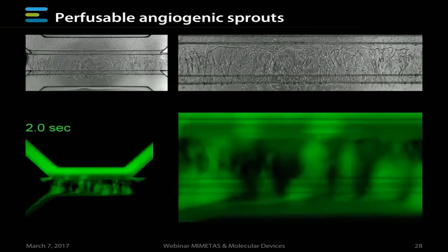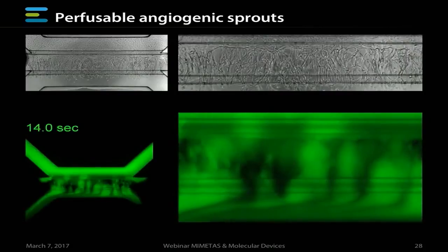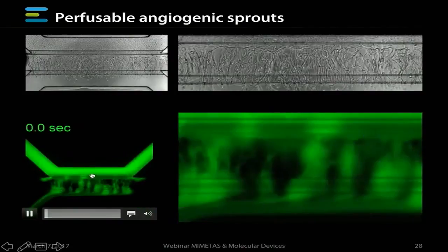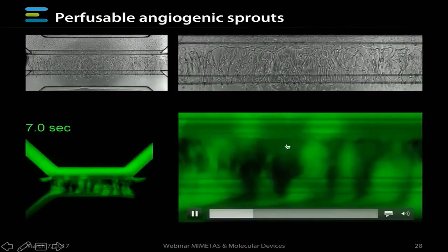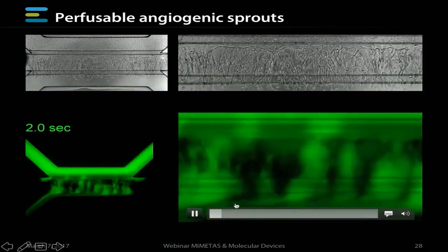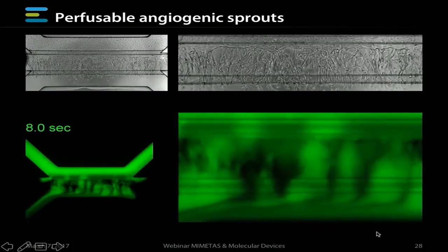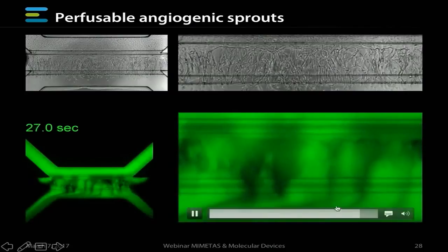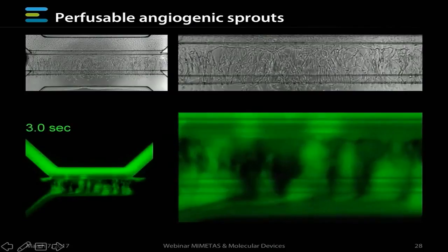So to show that these microcapillaries are actually perfused, we've entered a fluorescent dye into the blood vessel channel, which is the top channel here. And here you see that the dye flows through the microcapillaries and enters the channel at the bottom, which is the medium channel. There we go. So these microcapillaries are actually connecting the blood vessel channel to the medium channel at the bottom.